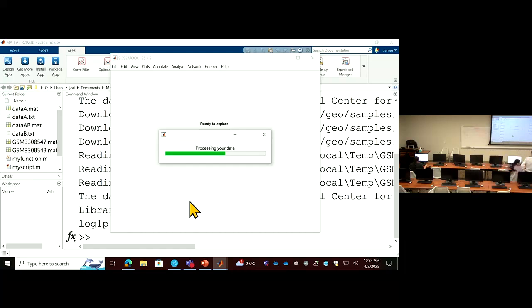Yeah, still waiting, yes. You have, okay, you imported data or you downloaded? The downloaded one, okay. The imported one. Okay, good. Yeah, you just wait. What's this? Species, mouse, yeah. Okay.